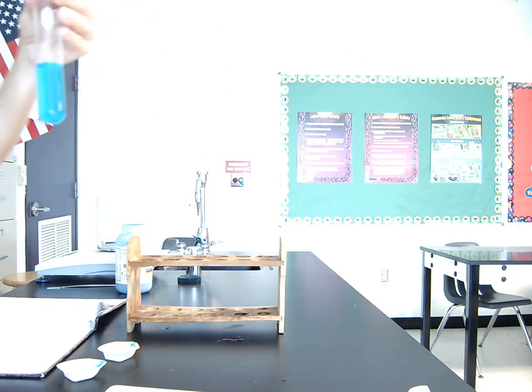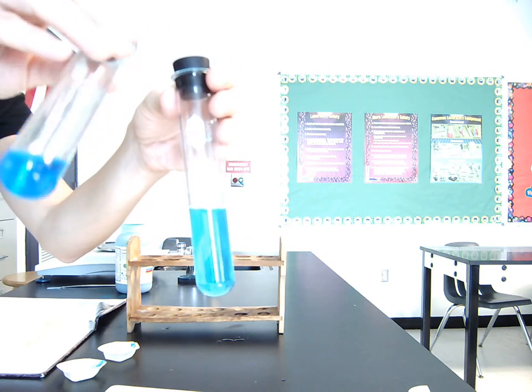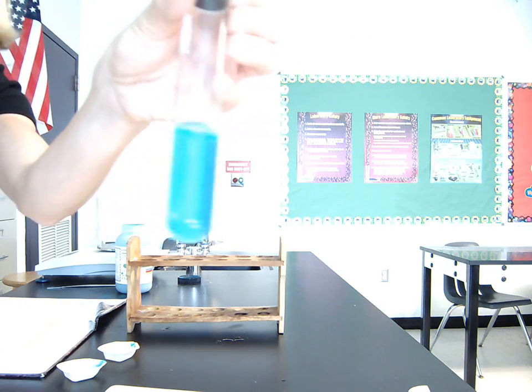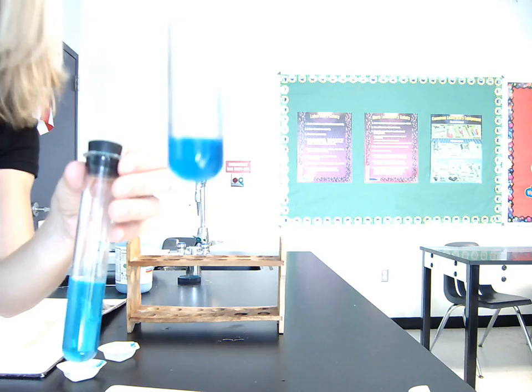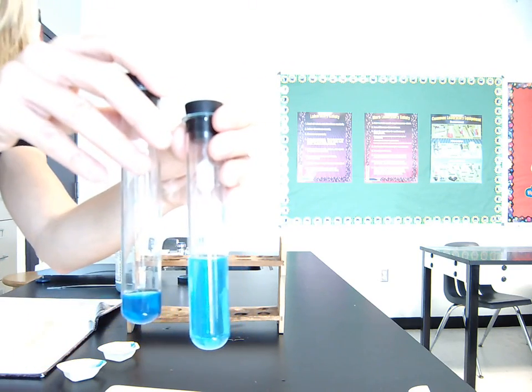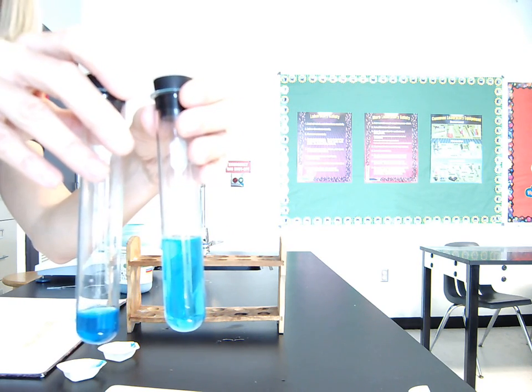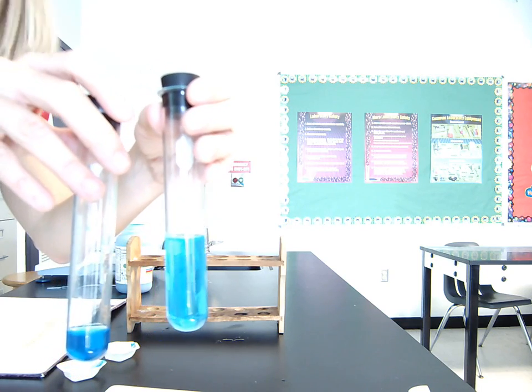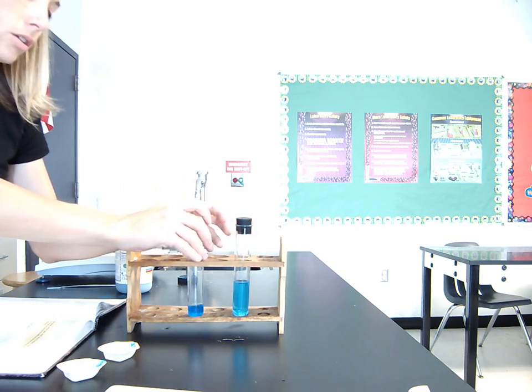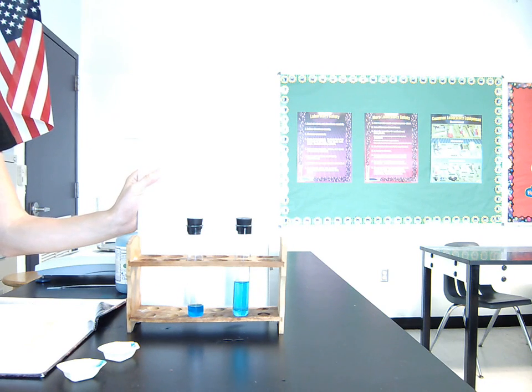Okay. Let's see. I don't know how well this is going to be able to show up on here, but hopefully you can see that in both of these test tubes, there's no stuff left undissolved. All of it is completely dissolved in both test tubes. And again, you can definitely see a difference in their color, which makes sense because the one with less water has less room for all that blue stuff to spread out. The one with more water has more room for all the blue stuff to spread out. So it's going to make sense for the solution with 5 cubic centimeters to be darker in color. And you can probably see it a little bit better there.